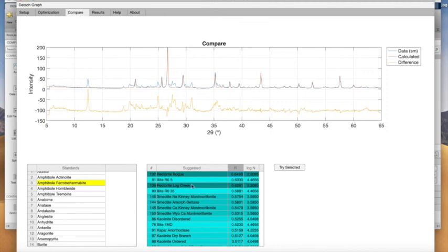And you can see the rectorite would not be as common of a thing as your smectite or your illite. I'm going to look over here at low angles and see this kind of broad hump right there in the pattern, in the blue, I'm sort of tracing out there. Well, that indicates to me that there's probably some smectite in here.